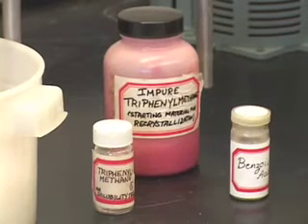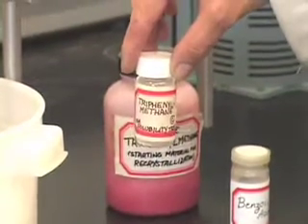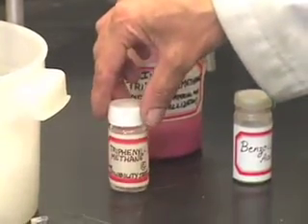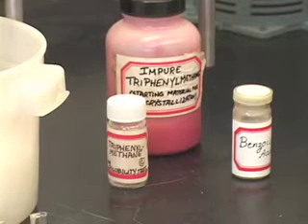So, please do bear in mind that you have to use the standard triphenylmethane for selecting the suitable solvent for recrystallization purposes.